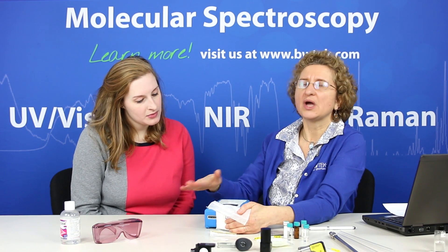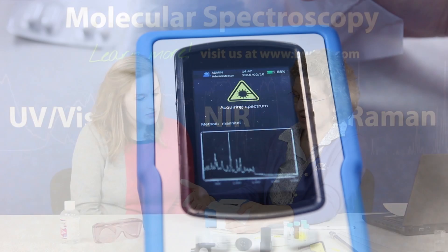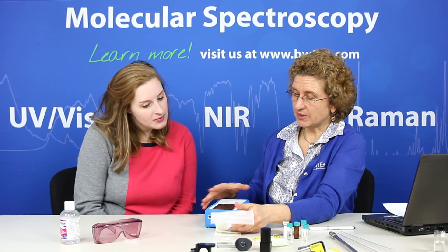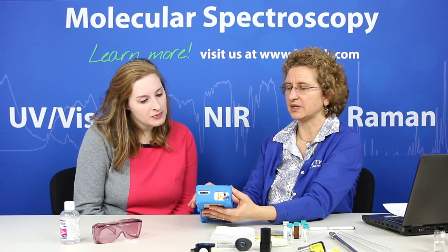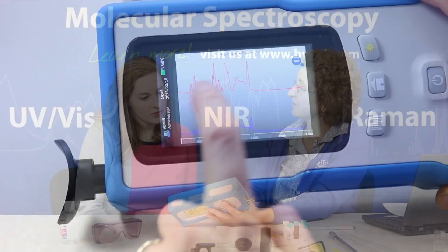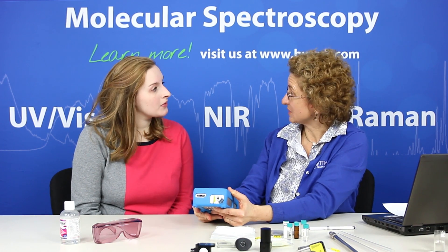It auto-integrates and determines what the optimal measurement time is to get a good signal, and then it makes that comparison to what we've said it is and verifies it, giving us a pass result. Here we see the pass result showing it is mannitol, and we even have the ability to look at what we've measured versus what our method is. You can see that it's very similar, which of course is in accordance with the fact that we get a passing result.